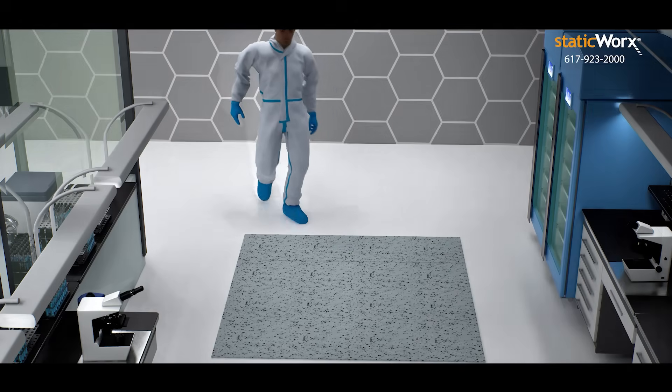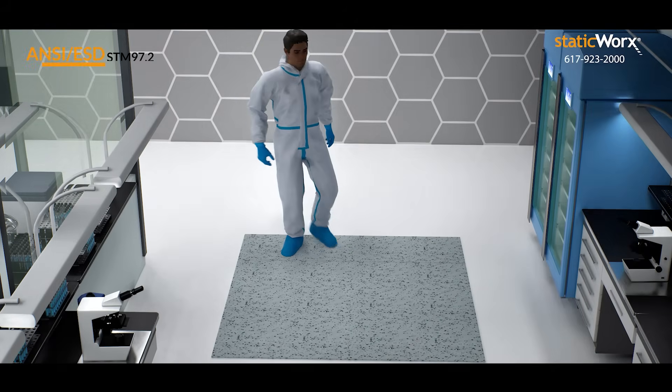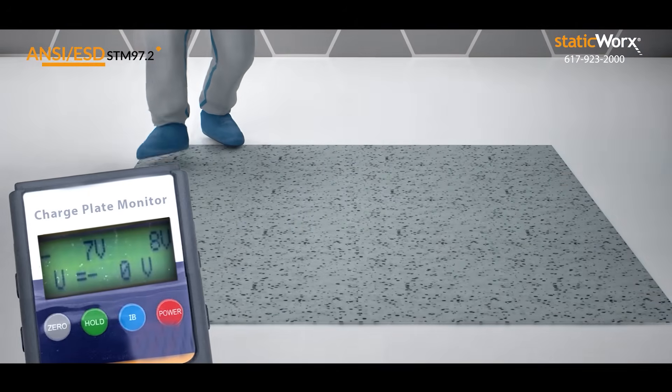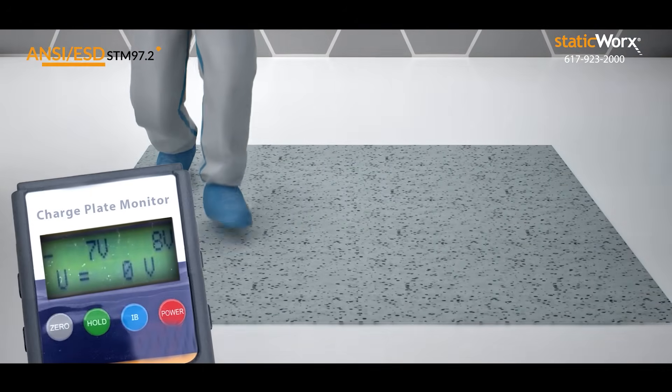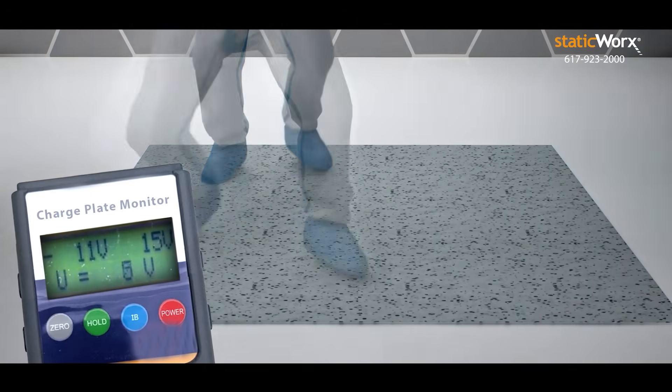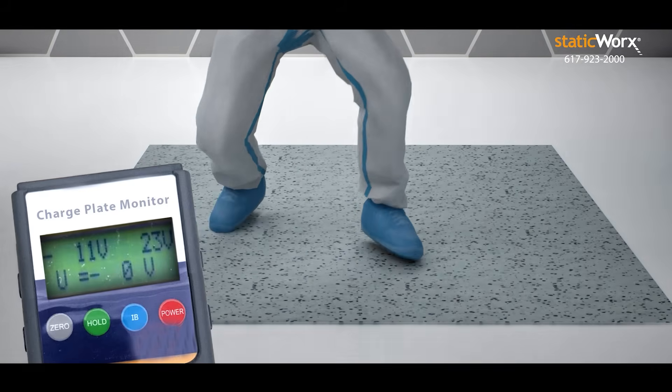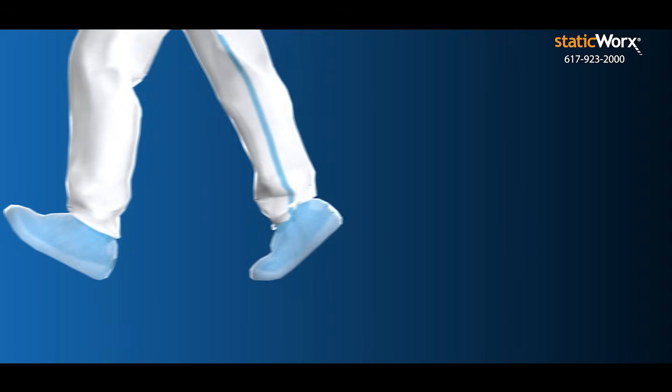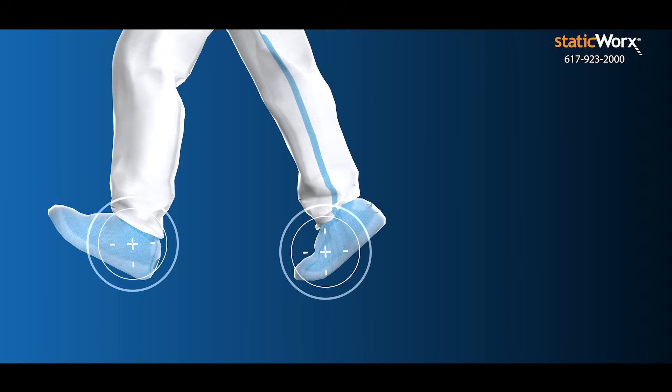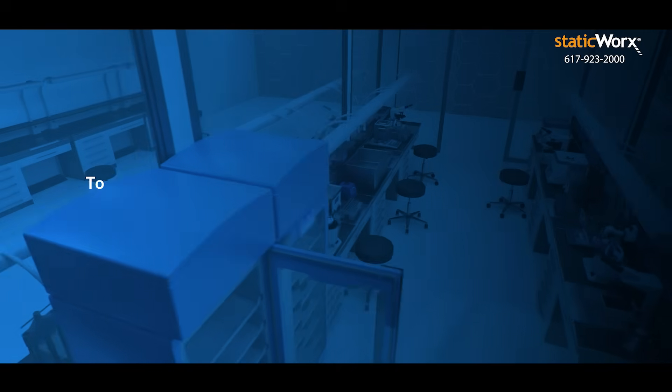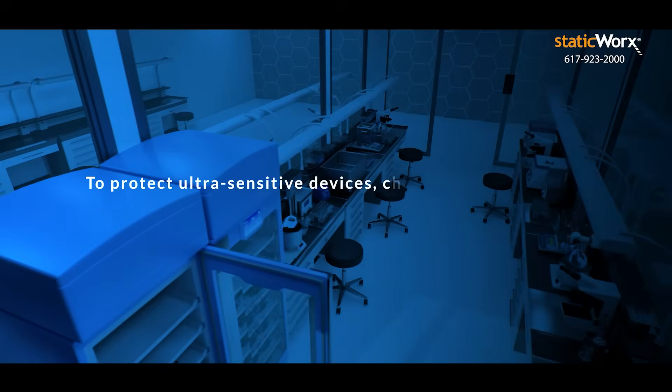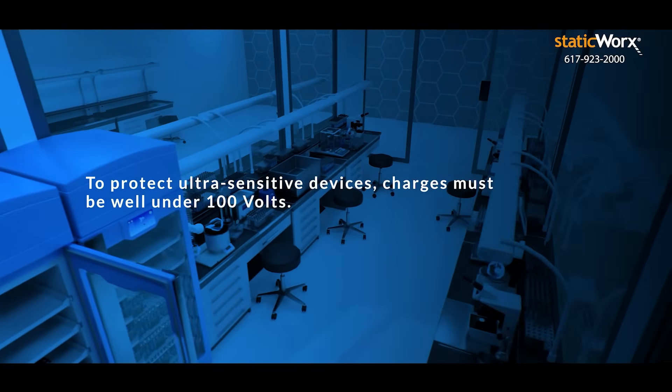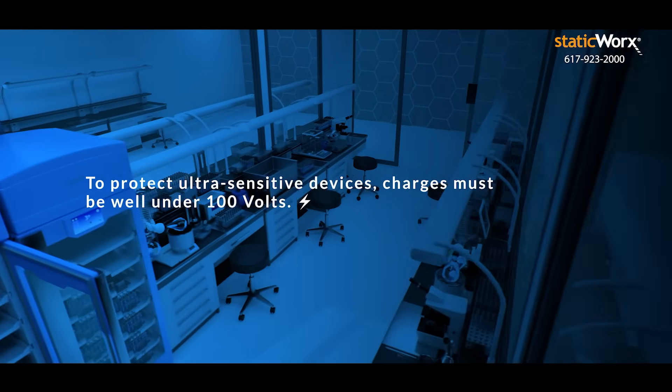You also need to check charge generation. Test method 97.2 tells you how much of a charge you'll get when people walk on the floor. For meaningful results, the person doing the test needs to wear the same exact footwear people will use in the space. To protect ultra-sensitive devices, charges must be well under 100 volts.